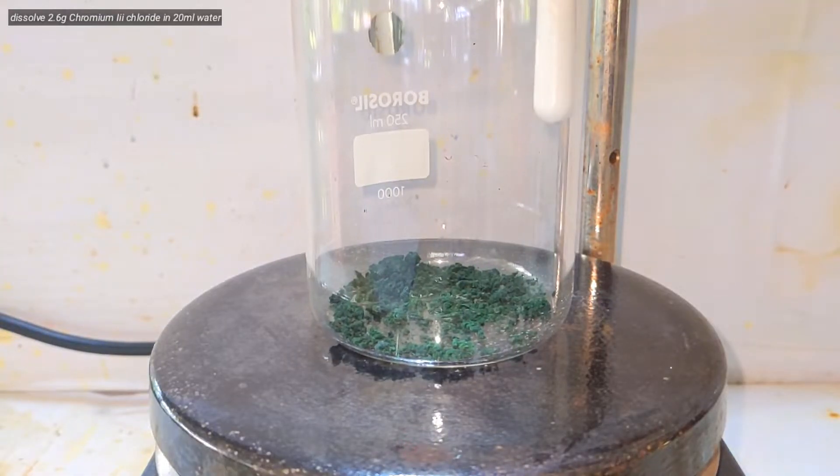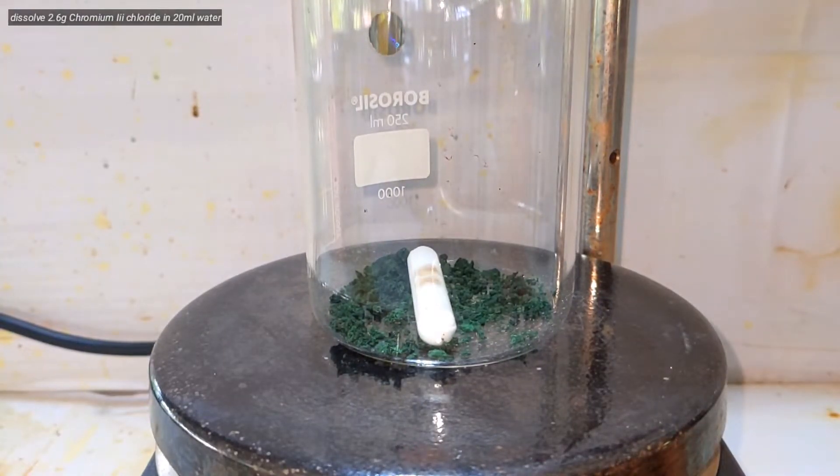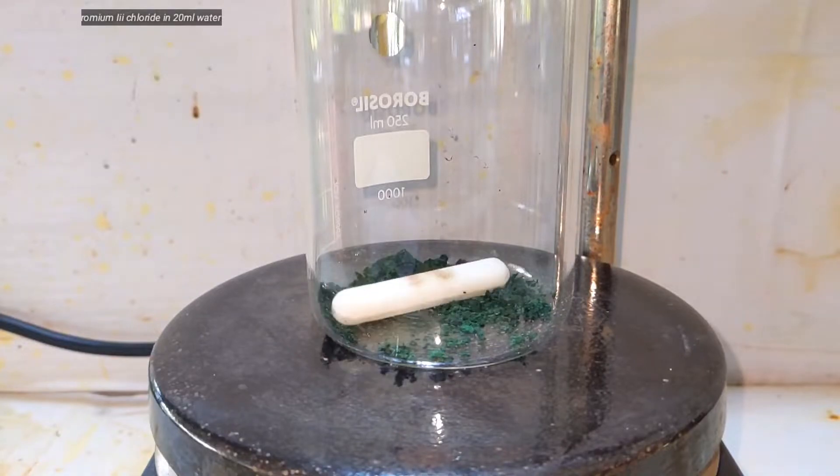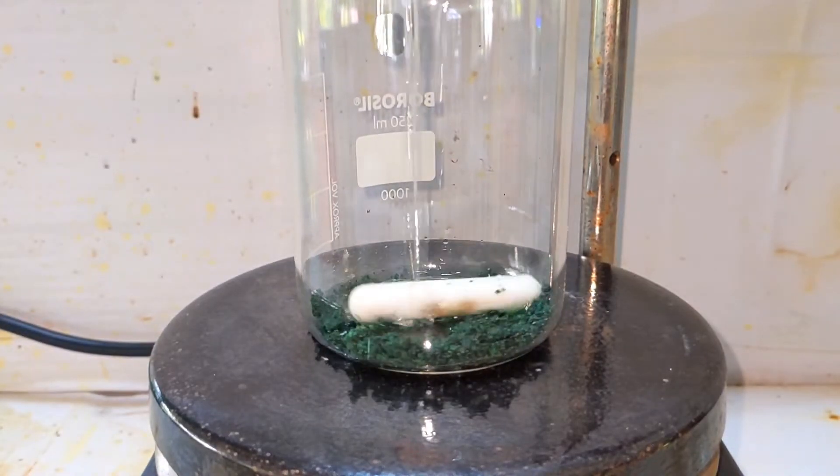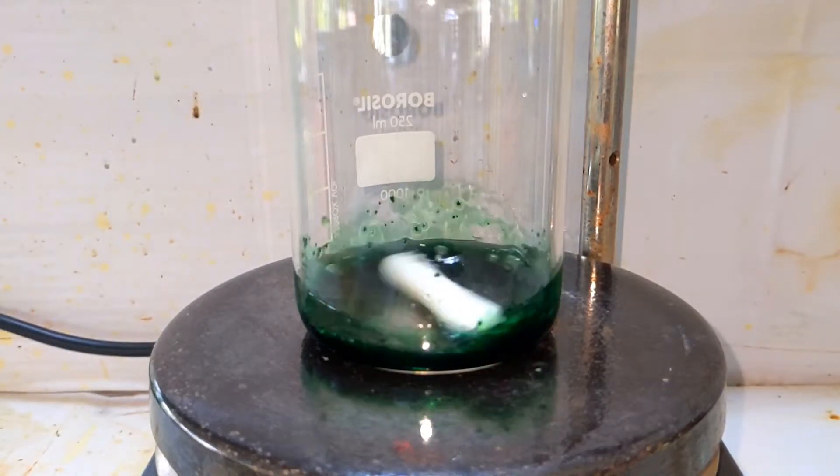Start by dissolving 2.6 grams of chromium chloride in 20 milliliters of distilled water. Chromium chloride has a nice green color to it.